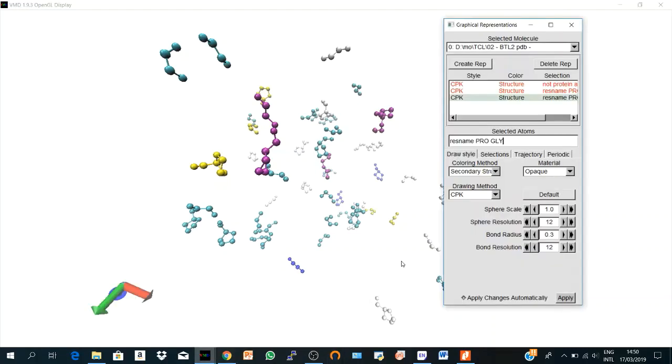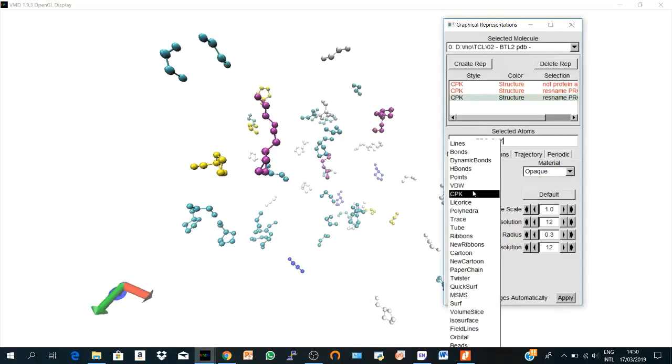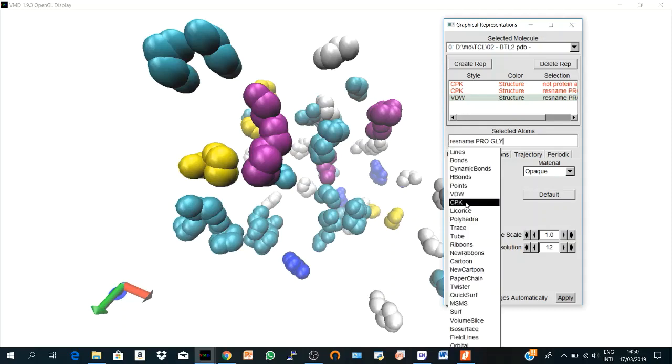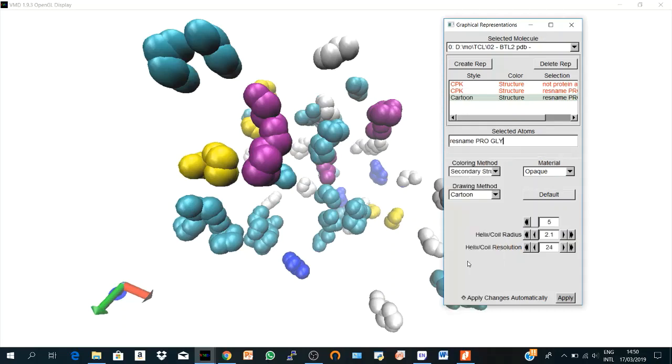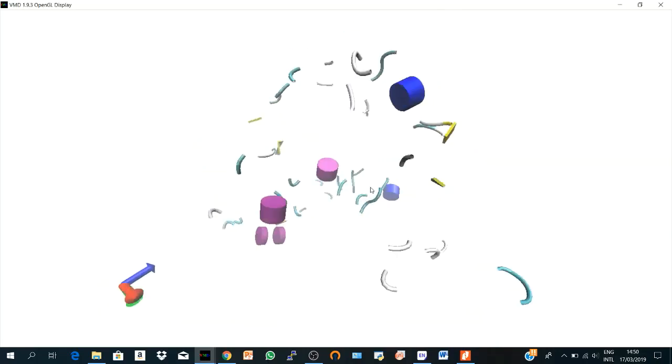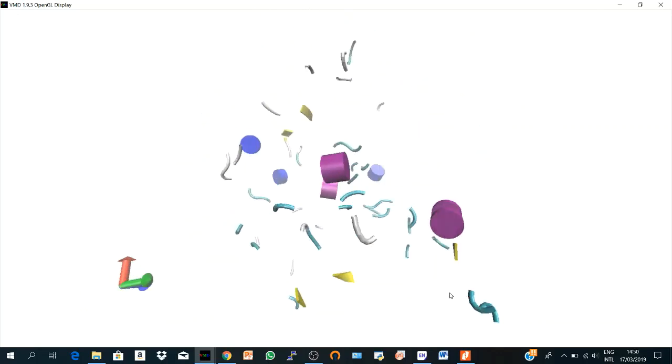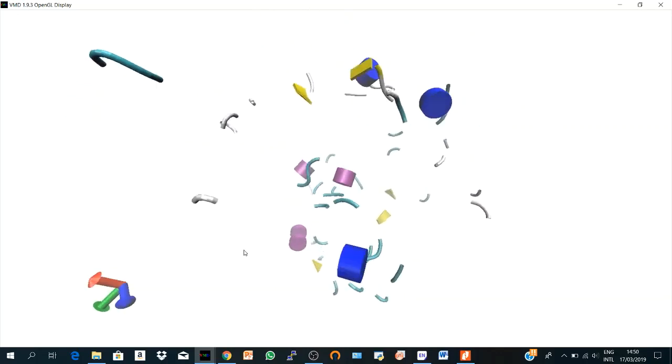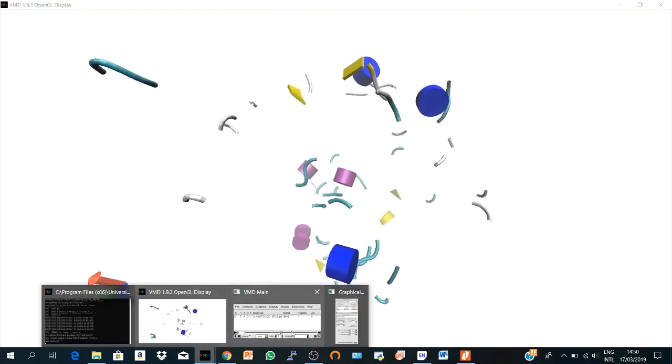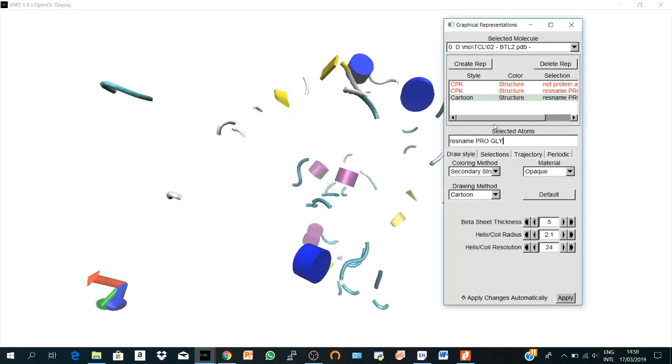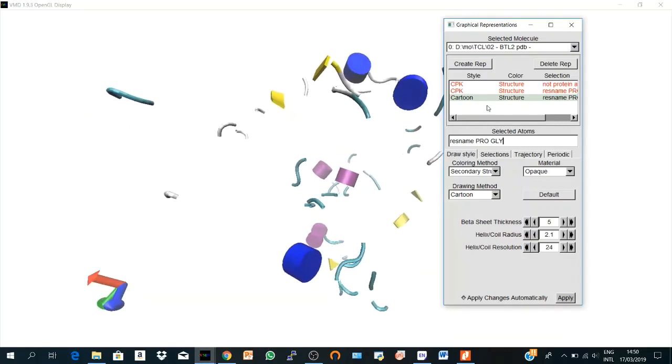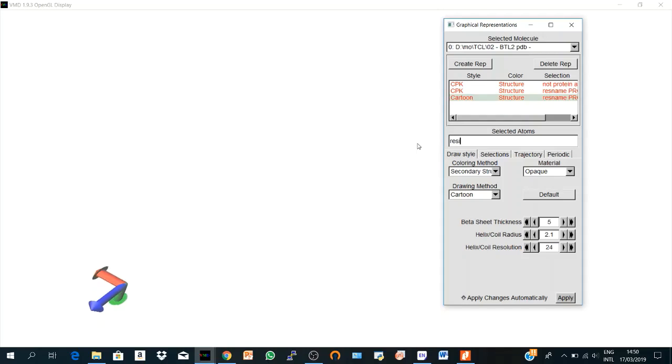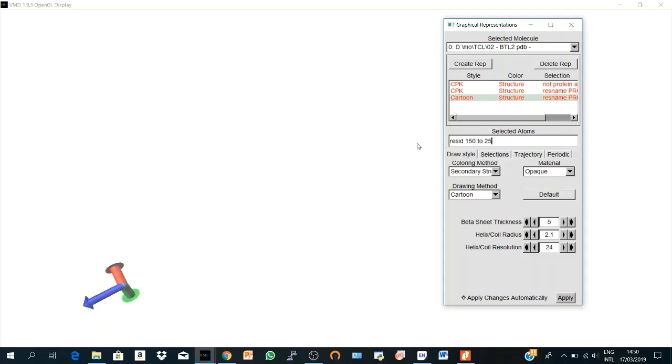Also, you can change it to say let's say VDW or New Cartoon. See, these are the prolines and glycines in my structure. Let's hide this representation and create another one. Double-click here. And let's say there's another command which is ResID. So I'm telling VMD to show me the residues from 150 to 250, for example. And I say create a representation.